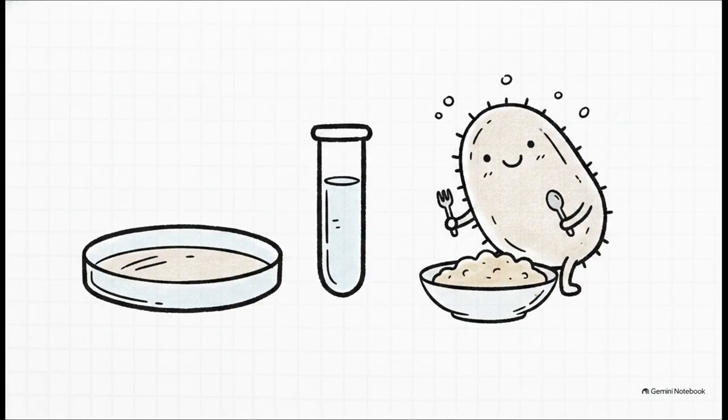Now, if you're feeding bacteria that aren't particularly picky, you just use basal or simple media. Think of these as the standard, everyday meals of the microbial world. They're used for routine cultivation, basic biochemical testing, and really just maintaining easy-to-grow, non-fastidious organisms. Common examples you'll see around the lab include nutrient agar, nutrient broth, and peptone water.